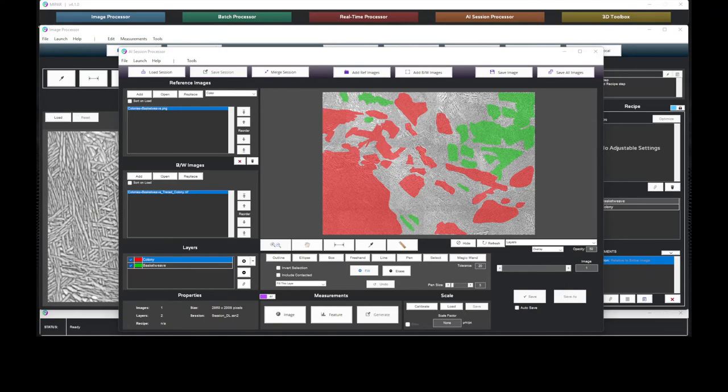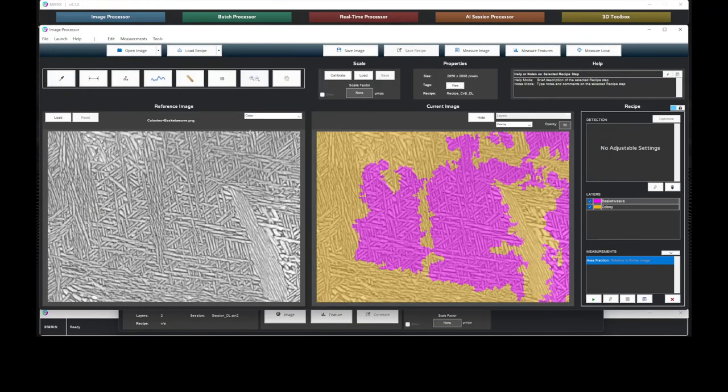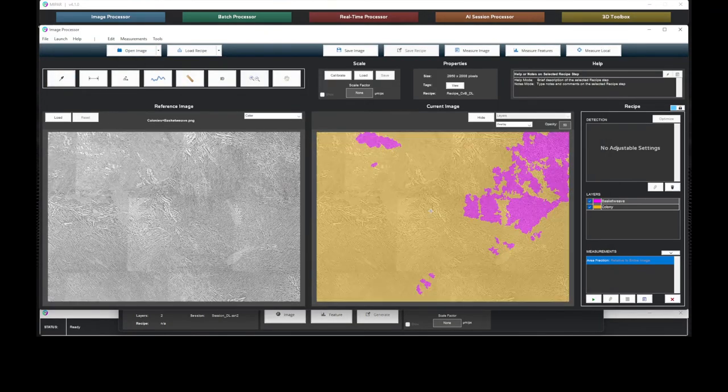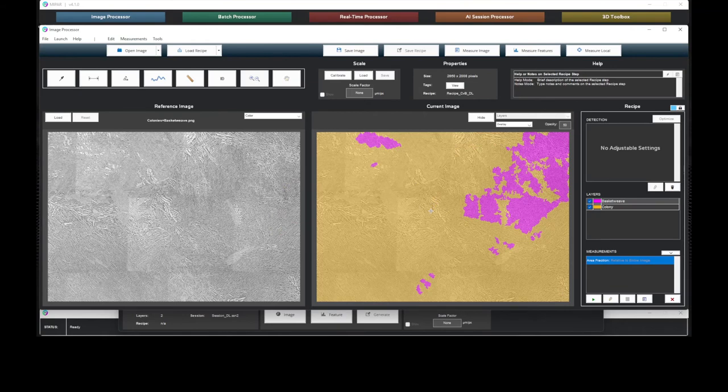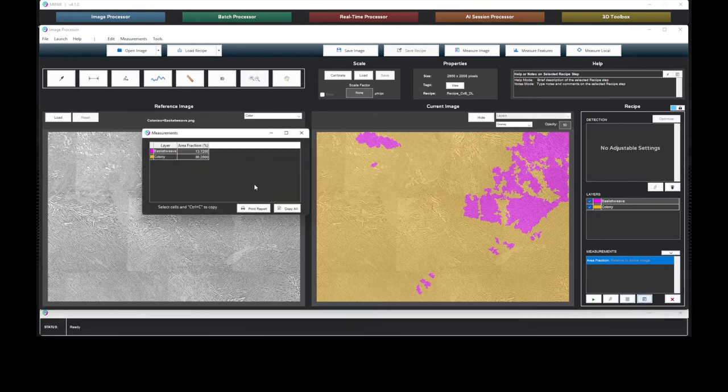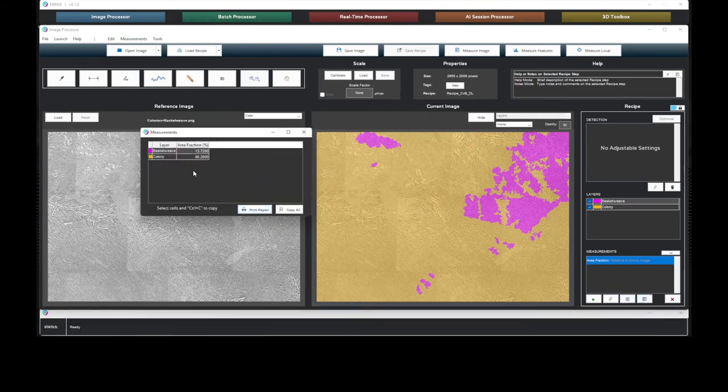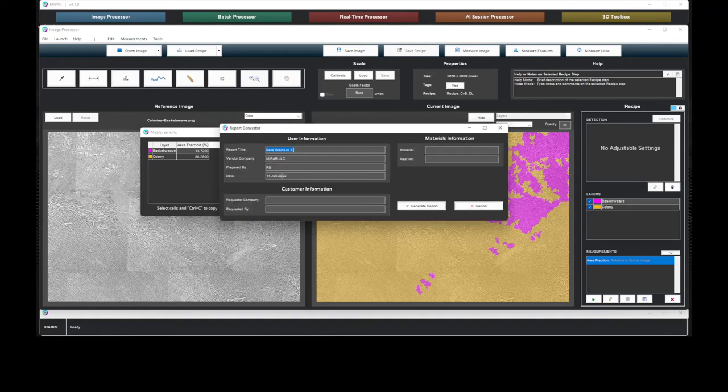Now, let's go back to the image processor. With the microstructure identified, it's relatively straightforward to generate a measurement report and output the results to your Word document.